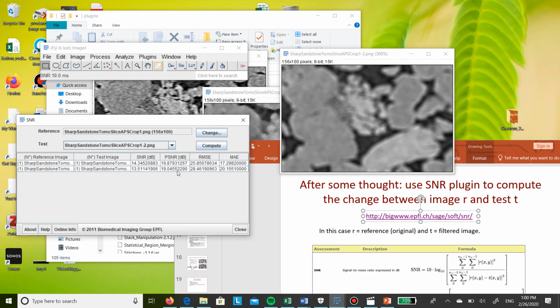My signal to noise ratio though is slightly smaller, but it's arguably too blurred, so I do want SNR to be larger for a sharper image. So this SNR is larger, which is good. I want signal-to-noise ratio to be larger. Okay.